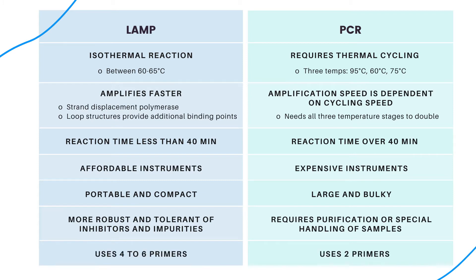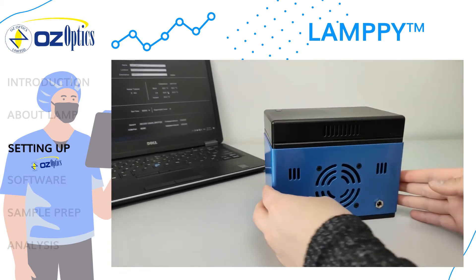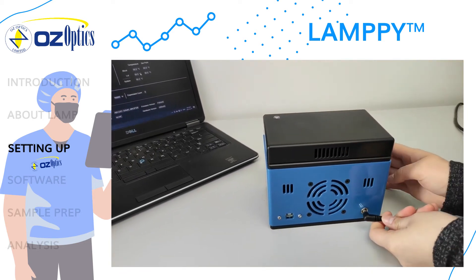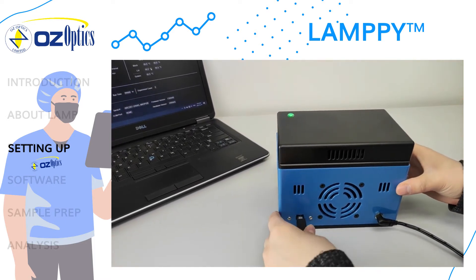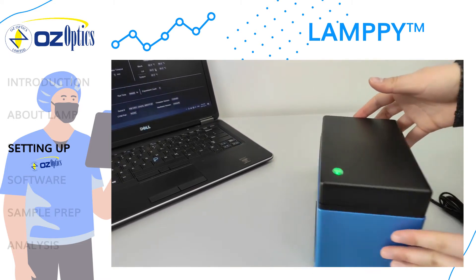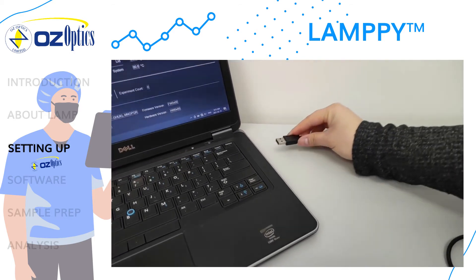Finally, LAMP typically uses four to six primers, whereas PCR only uses two. To get started, plug in the included power adapter into the back of the instrument and plug the other end into an electrical outlet. Next, plug the USB cable into the back of the instrument and plug the other end into the computer. The instrument is ready to go and no calibration is needed.